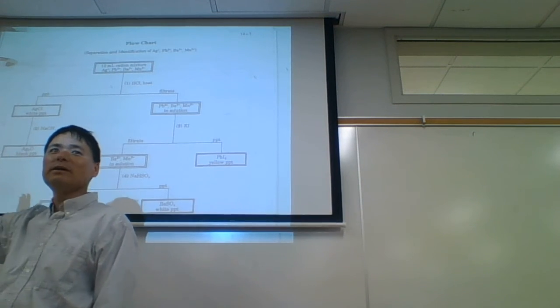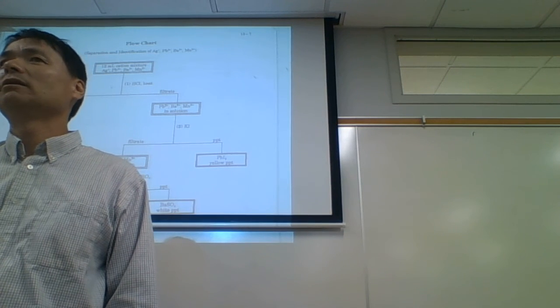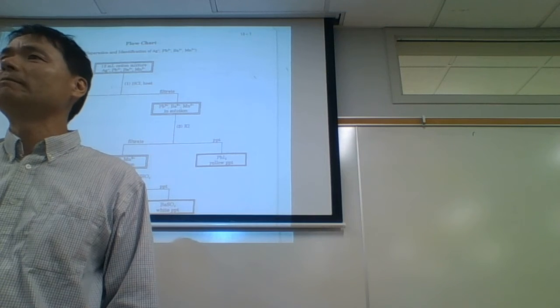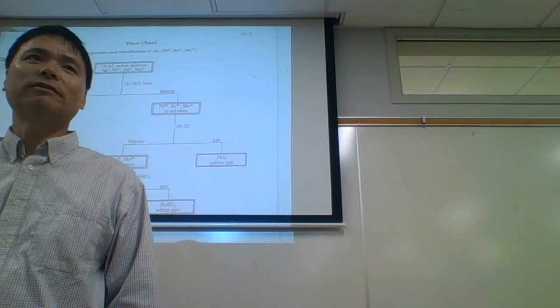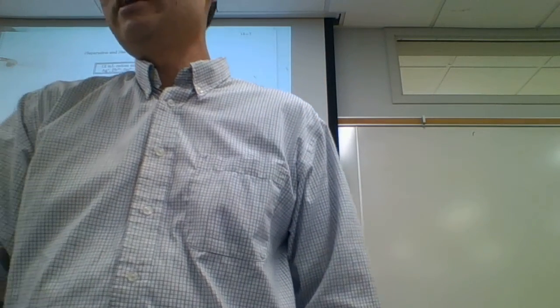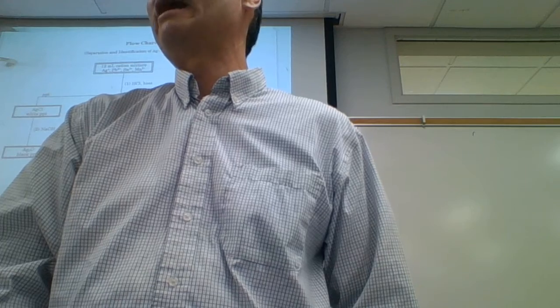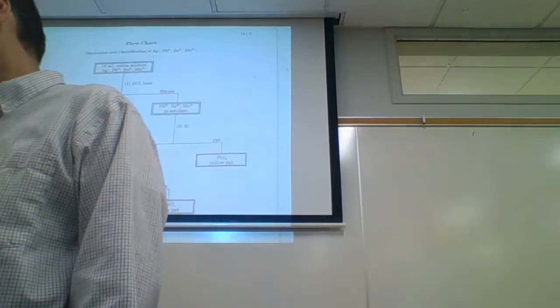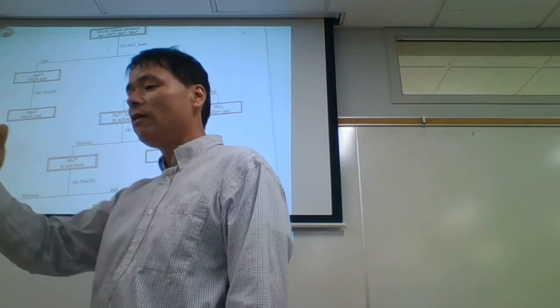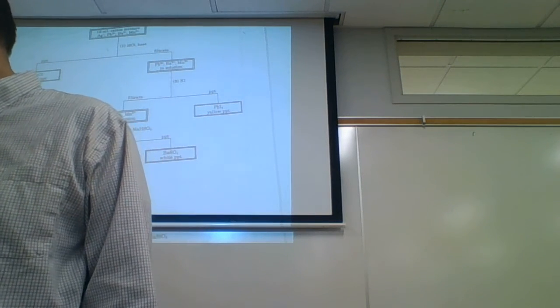And they come up to me and go, oh, mine didn't turn black. Well, it didn't turn black because you probably filtered out lead. It probably cooled and you filtered out lead. Except I'm not going to tell you that. I'm going to ask you to try to figure out what happened. But it happens all the time that students get very confused because they're trying to follow along on the procedure, but it doesn't follow the procedure exactly.